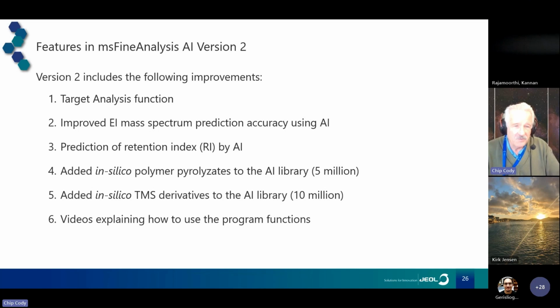If everything matches, then of course we're going to color code this as a high degree of confidence. If there are candidates with questionable data, then those are flagged in yellow, and things that don't have matches that don't show up from your target list are left out. So we've got target lists for things like volatile organics, for polymer additives, off flavor compounds, and you can create customized libraries. I made one for whiskey aroma compounds and looked for peated scotches and things like that.